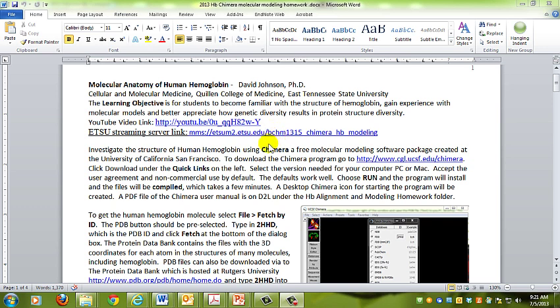We're going to use a program called Chimera. Chimera is a free molecular modeling software package created at the University of California San Francisco. The reason we're using it is twofold: one, it works very well, and two, it runs on both PCs and Macs.